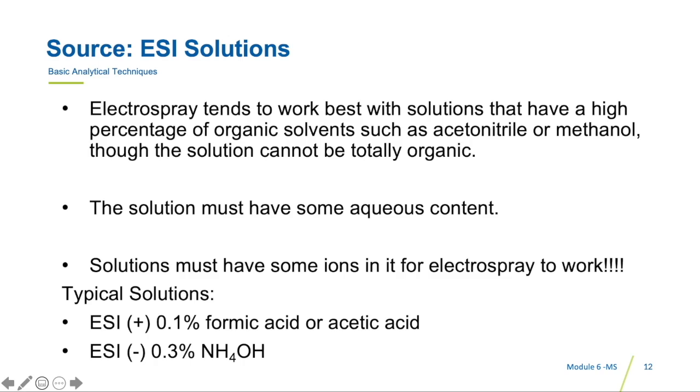It's important to note that these modifiers serve a function of helping the ionization, but they must also help, or at least not hinder, the chromatography separation that precedes mass spectrometry. Other modifiers are available and useful in various applications, but for the new analysts in the food safety laboratory, remembering these three will help understand most of the relevant methods.